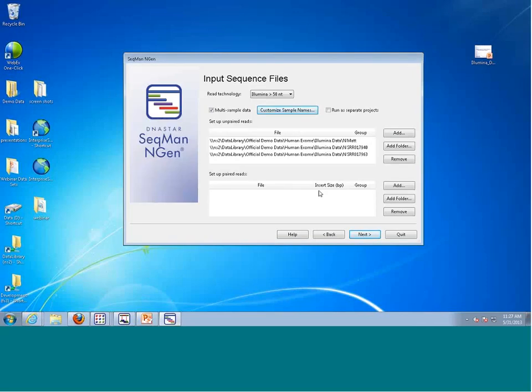And what will happen then is when we run the assembly, these 3 samples will align to the reference sequence together. And for many different projects, it really facilitates the analysis to have all the projects together aligned to a reference. We can compare them directly. We can see which samples have SNPs, which do not, and the visualization is excellent.